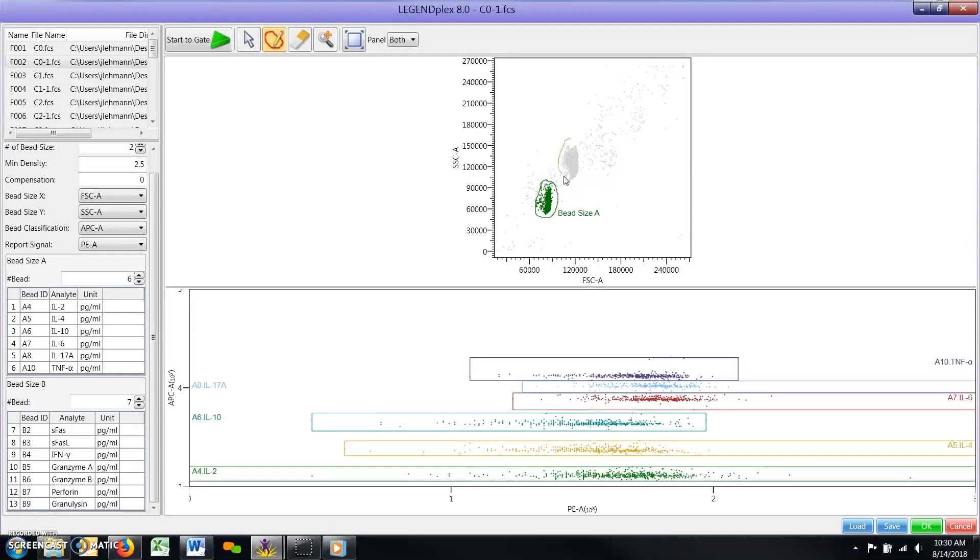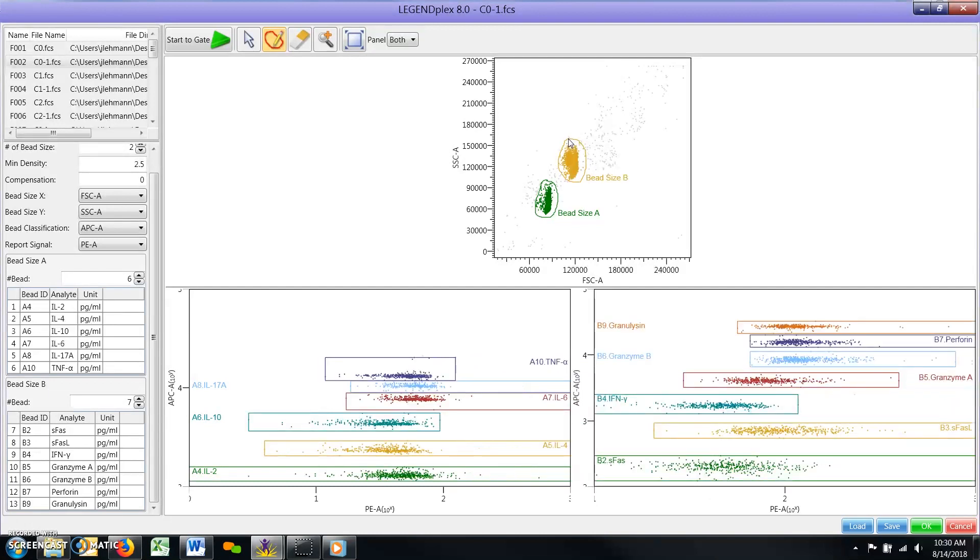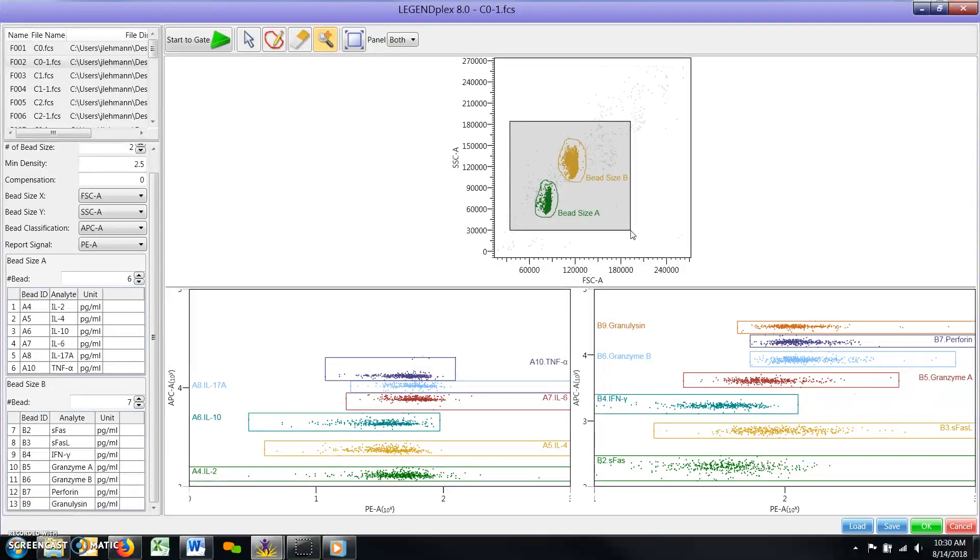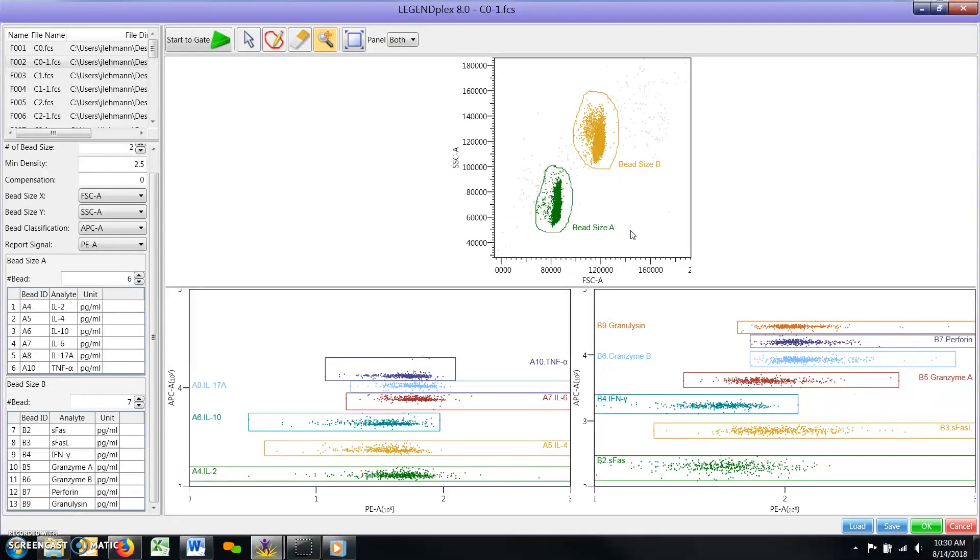Note, if bead populations are difficult to see on the sizing plot, you can select the magnification icon from the toolbar and left click and hold to define an area on the plot to zoom into. This can be repeated up to three times for further magnification.